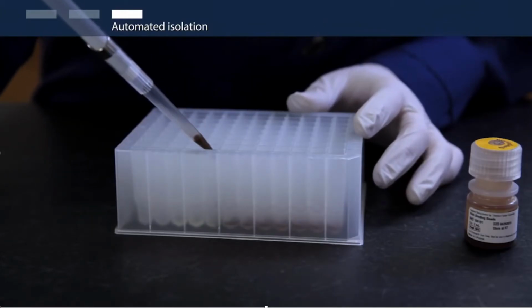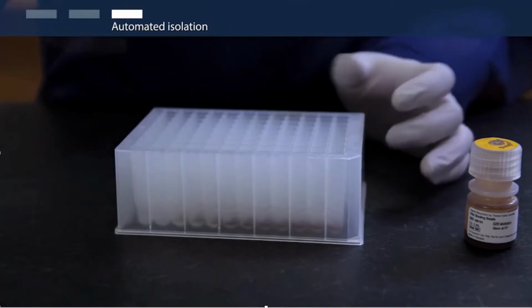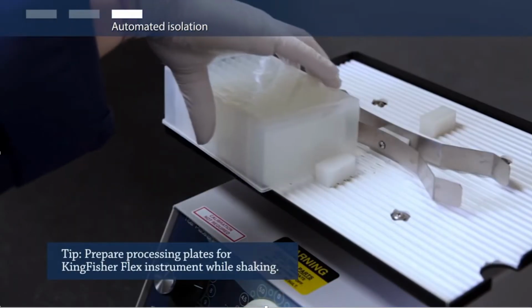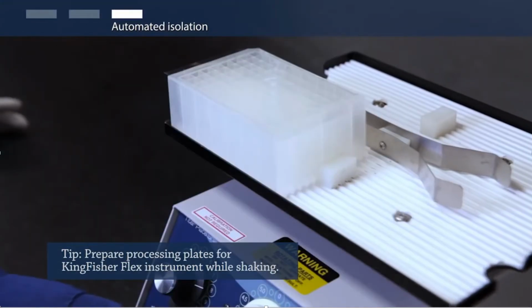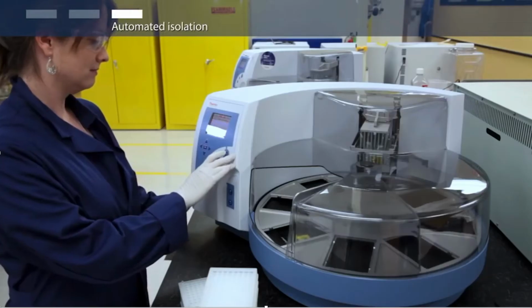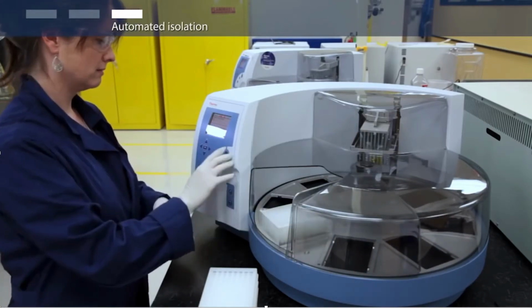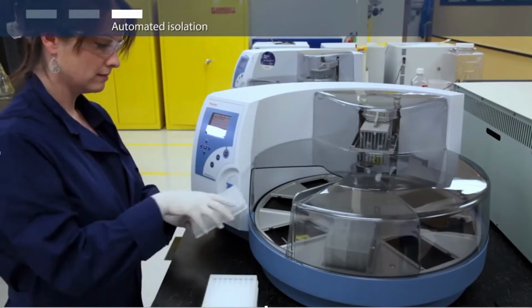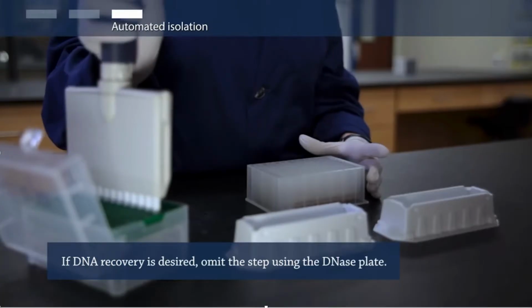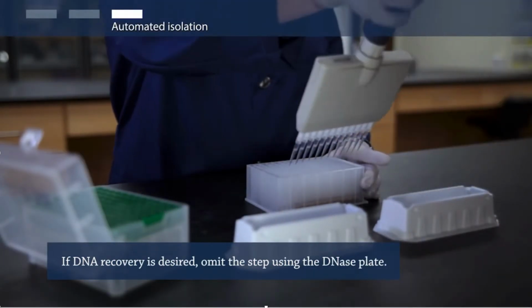Now add 100 microliters of lysis binding mix and 20 microliters of RNA binding beads and shake for 5 minutes. Add isopropanol and shake for 10 seconds. Load your prepared plates into the KingFisher Flex instrument. When prompted, add the rebinding reagents to the DNase plate. Put the plate back on the KingFisher Flex instrument and resume run.